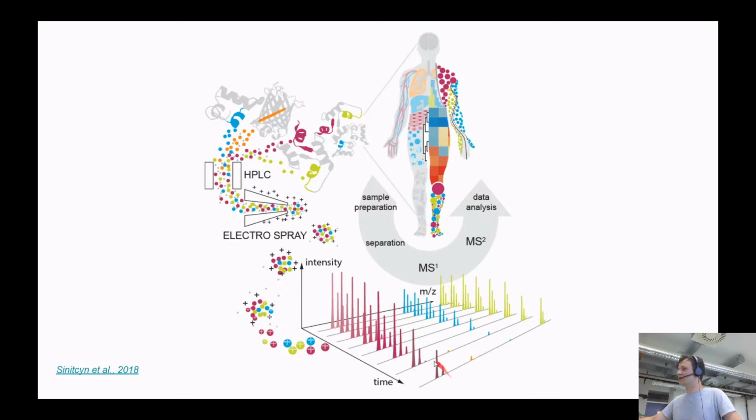We also see isotopic structure. And thanks to seeing the isotopic structure, we can see the distance between neighboring peaks. By measuring the distance between neighboring peaks, we can understand what the actual mass of the peptide is. And by knowing the mass of the peptide, can we actually get to know what the sequence of the peptide is? So I think this is a question mostly to you guys. By knowing the mass of the peptide, can we find out the sequence of the peptide?